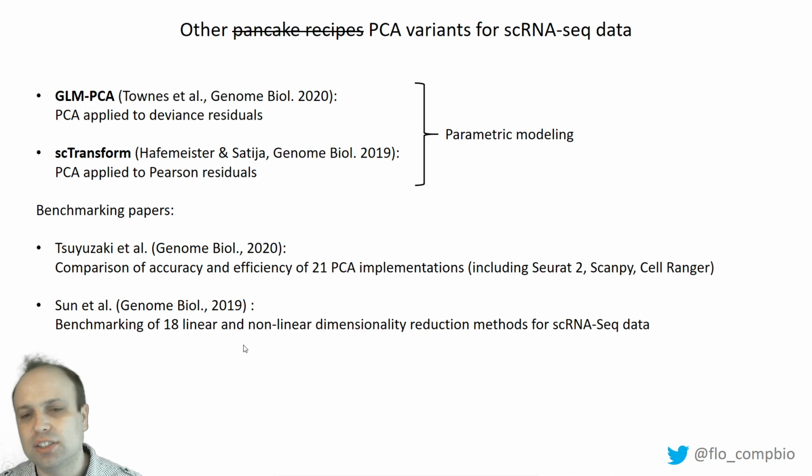But I think it's still fair to say that PCA by itself is by far the most popular dimensionality reduction method right now. t-SNE, for example, is way more popular as a visualization tool.